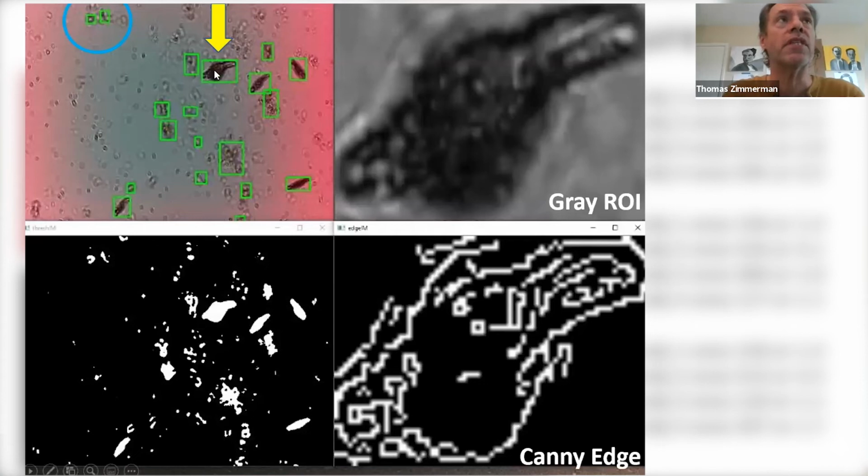And that is the contrast of black and white, the details of the insides of the object, because that should be a feature to distinguish, especially algae, which has lots of texture. So here's a blepharisma from this region of interest. This is the grayscale image.